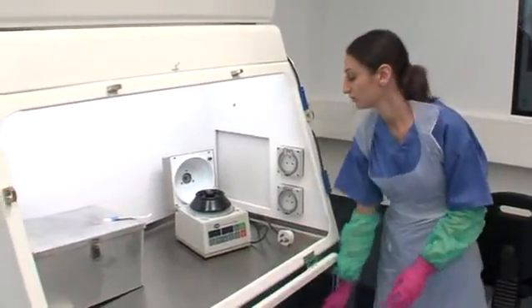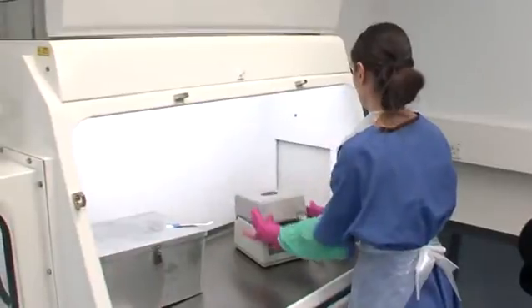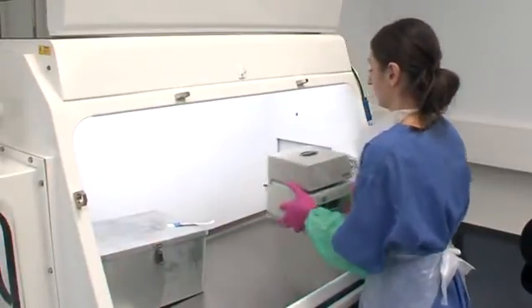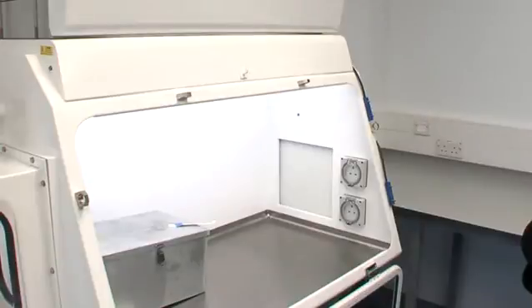The class 1 cabinet provides personnel and environmental protection and, because of its simple design, is still widely used throughout the world.